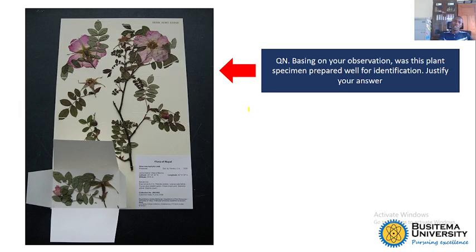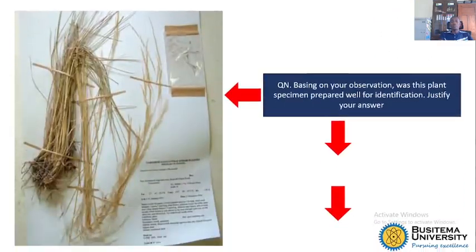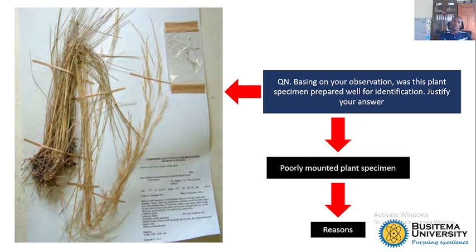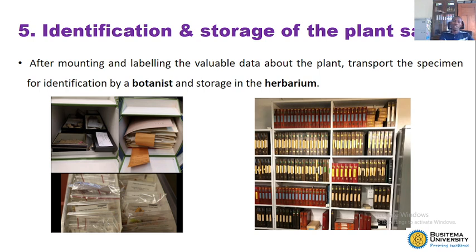Based on your observation of this plant, the specimen was prepared well — as you can see. This other one was poorly prepared, which makes identification more difficult and challenging for the botanist.